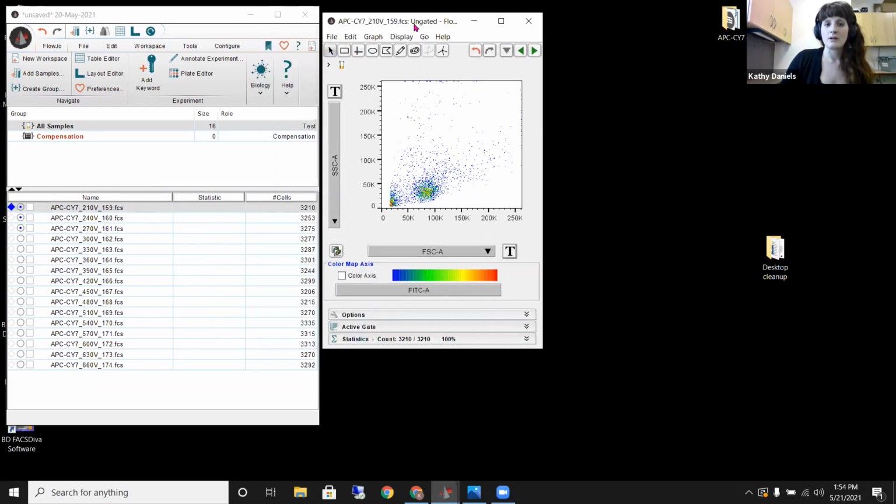And what you see here is that we have, just like Derek was showing, some debris in our forward and side scatter plot. And then also here, this population of cells, okay? These are actually lyophilized lymphocytes. So working in a flow core, or in my flow cores, we don't have any culture hoods. So these lyophilized cells wind up being really nice resource for us.